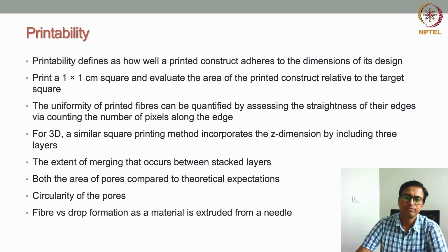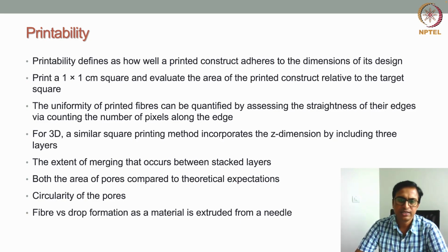That means when we make a CAD model and then print that structure from it, we determine the printability by whether the printed structure can be of the same dimension and same resolution as that CAD diagram.